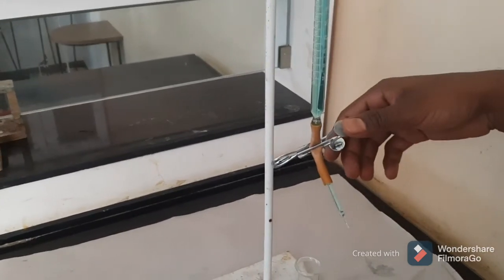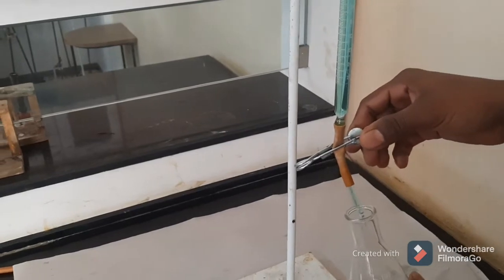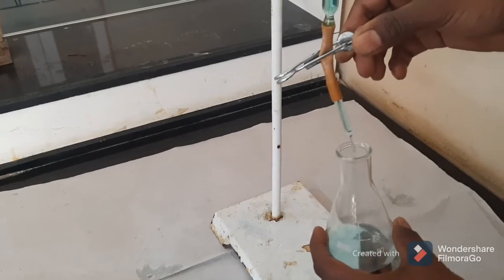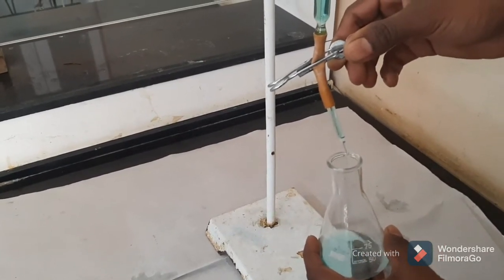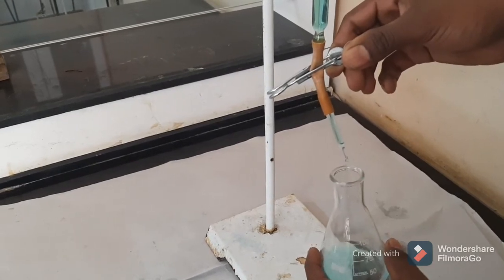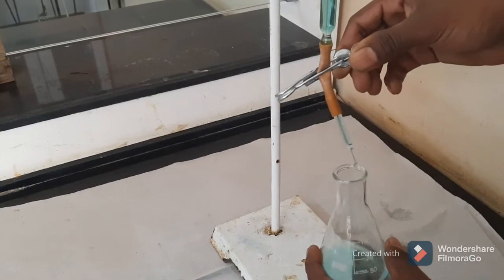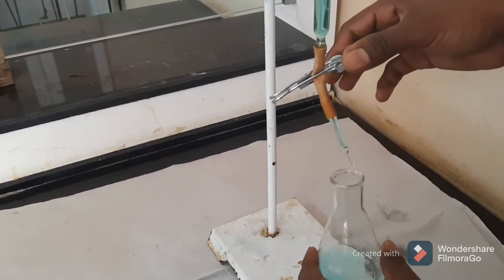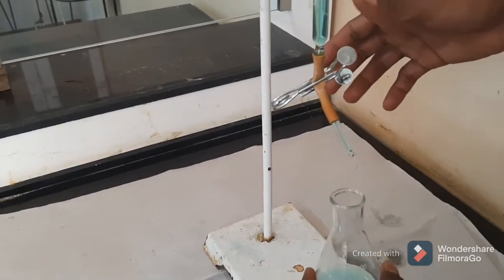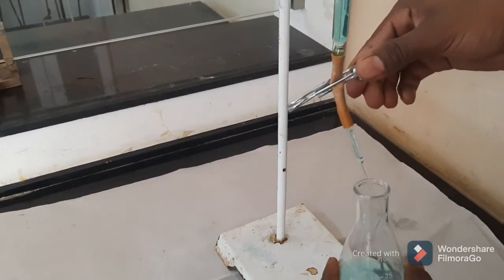The glass tube is attached to the rubber tube, which is attached to the pinch cock. By pressing the pinch cock with one hand, you can add the solution dropwise to the conical flask. While titrating, you add the solution from a burette to the conical flask. When you release the pinch cock the solution will stop, and when you press it the solution will get added drop by drop.